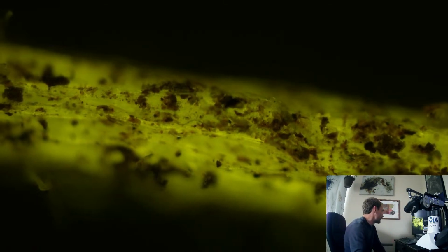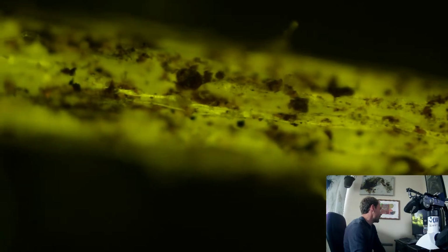So right now we're at 100x magnification with the scope, but I actually got it magnified digitally by just a little bit, or 2x or so. So essentially we're getting 4K from the camera right now, and we're kind of zoomed into 1080p.